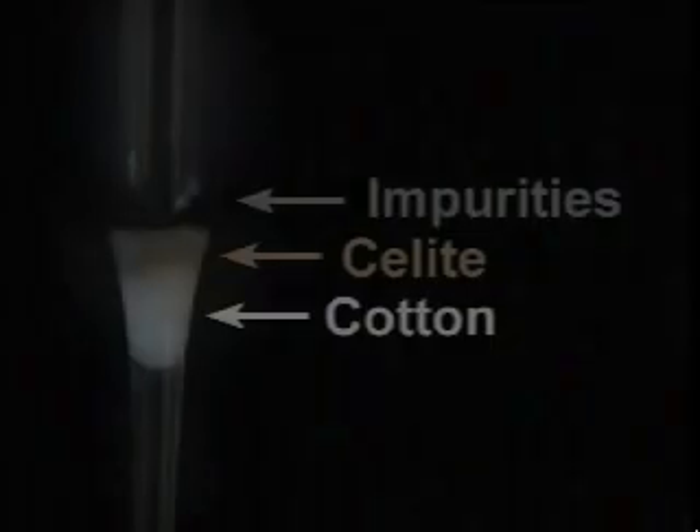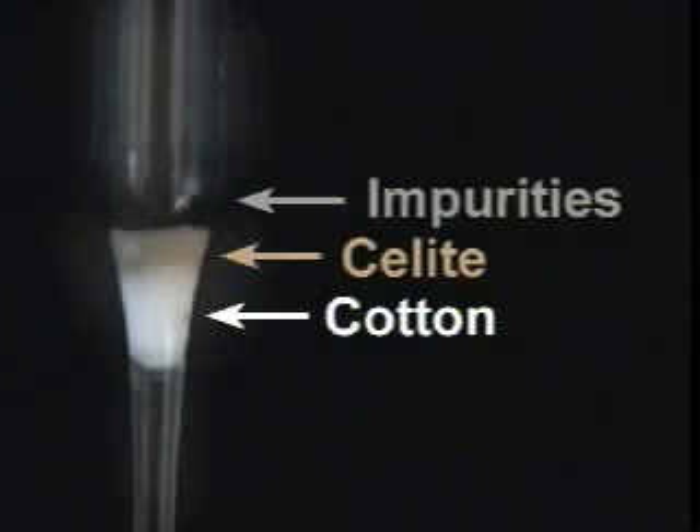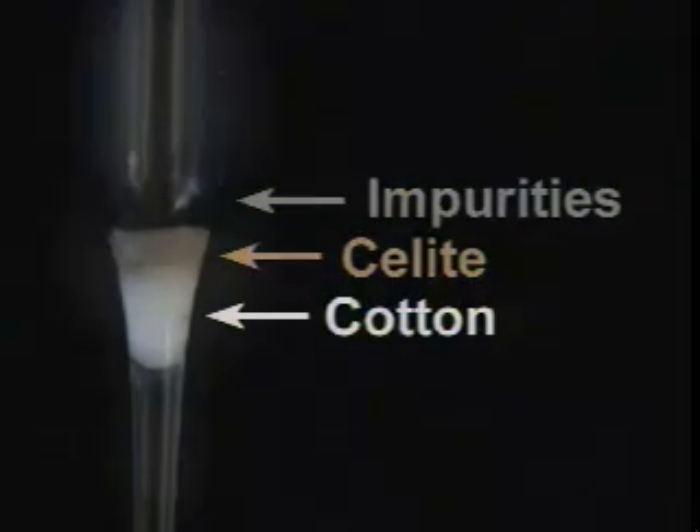Let's take one last look at our filter pipette. Here it is after the filtration. As you can see, impurities have collected on top of the celite. So that was microscale.